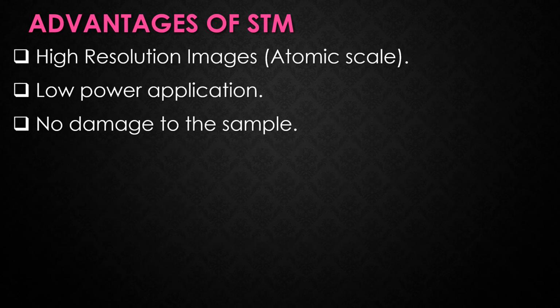The next advantages are high resolution images, that is in atomic scale, low power application, and finally no damage to the samples.